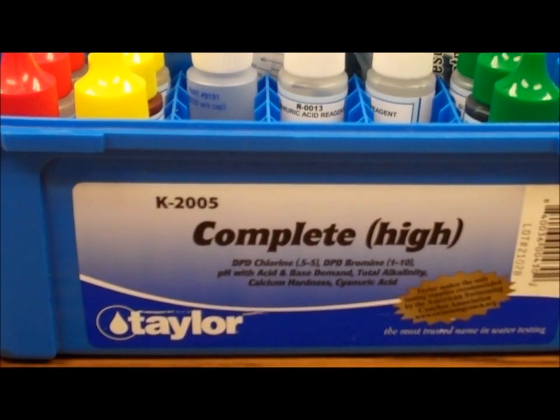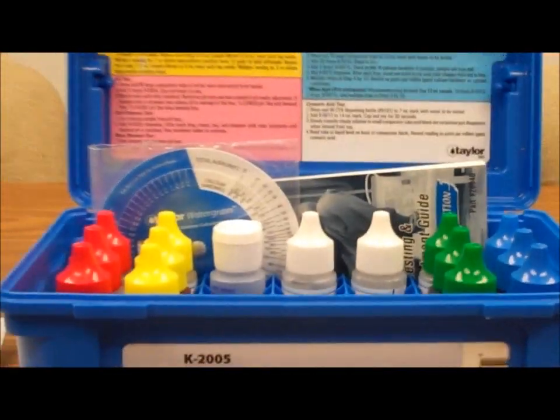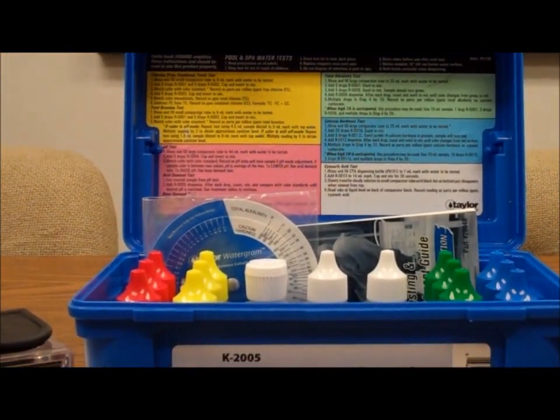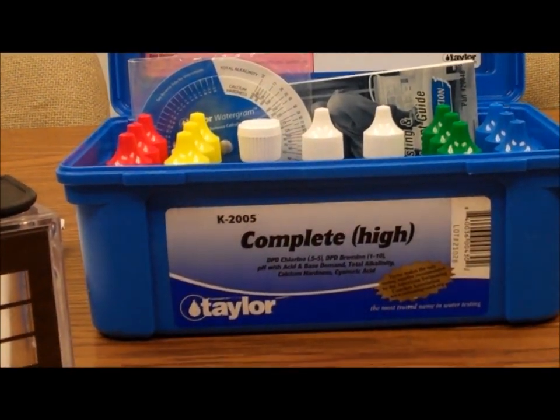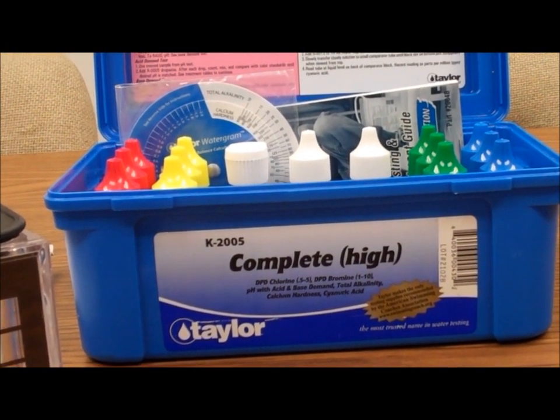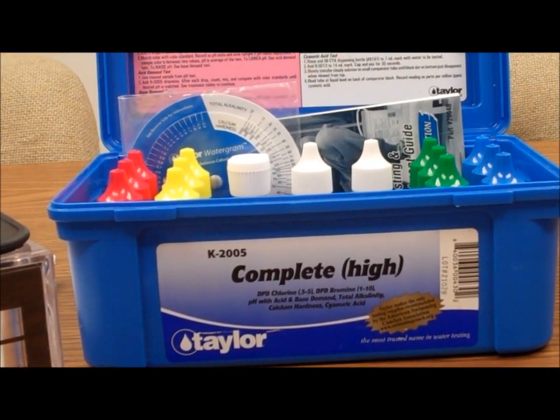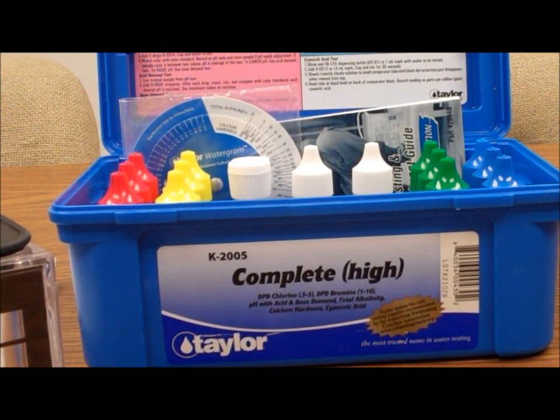So we've got the Taylor K2005 Complete High Test Kit for pool water. The 'high' means it tests in the high range for chlorine. It's a good all-around test kit for the pool owner who wants a good level of accuracy with five important tests.